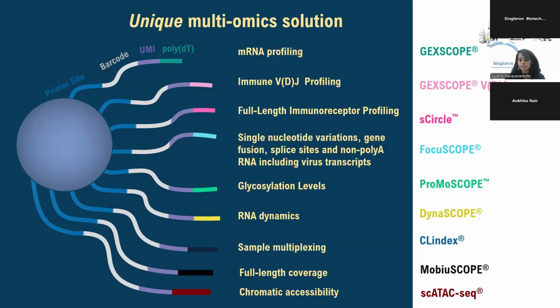So you can take any of these scenarios where you're interested in understanding the TCR or BCR profiles in the samples. And then there's also options to actually do ATAC-seq, to understand chromatin accessibility and what roles they play in disease. So there are a lot of single cell assays available, more than just doing poly A capture. And so these are all things to think about when considering clinical applications.